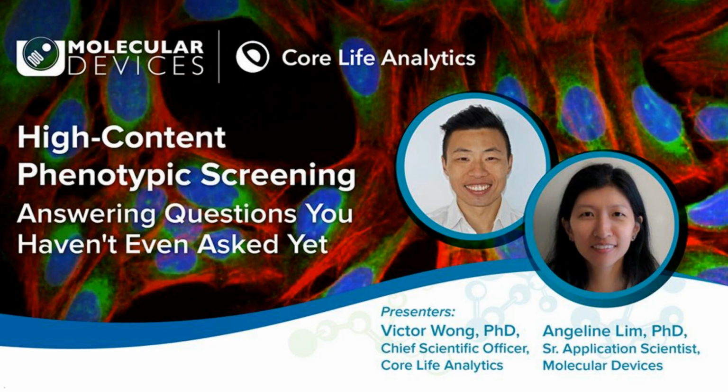Yeah, and I would like to also add that I forgot to mention one key term: when you're using high content phenotypic approaches, you are tackling the biological question with a very holistic view of what is happening within the cell. And that's tremendously important. I remember when I was a graduate student, my supervisor would always emphasize that you have to take science in an integrated, holistic view so that you can better study what is happening in the system.